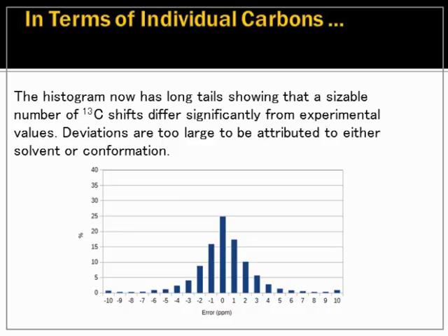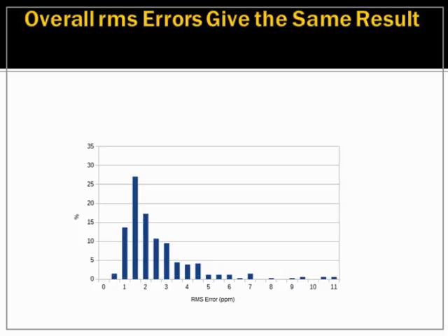If you look at this plot, and I'll do the atomic plot first, you see the curve is, again, nicely symmetrical. It's clean. But before we had almost no outliers past 5. Here you see outliers that go further. The big bar at 10 is everything 10 and beyond. And so here you see clearly there are more outliers. This is more clearly done by showing it over atoms.